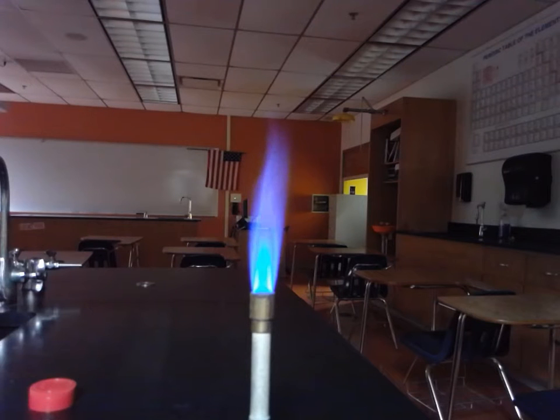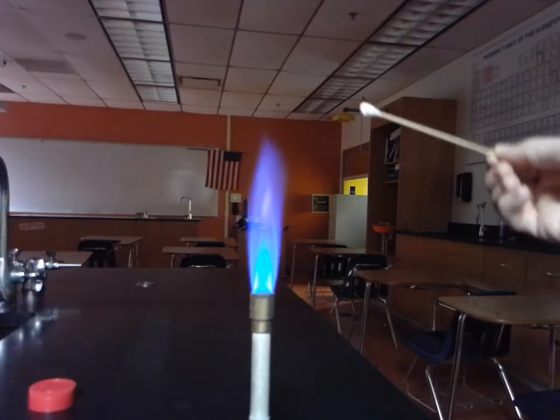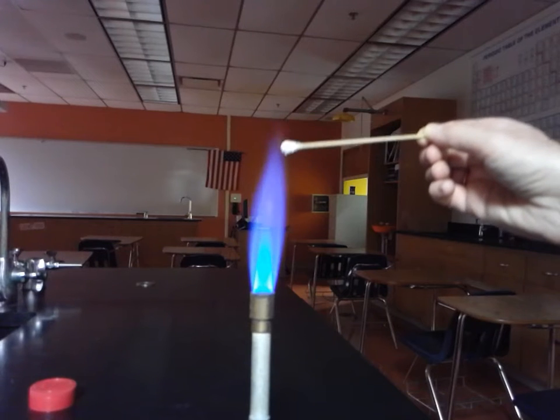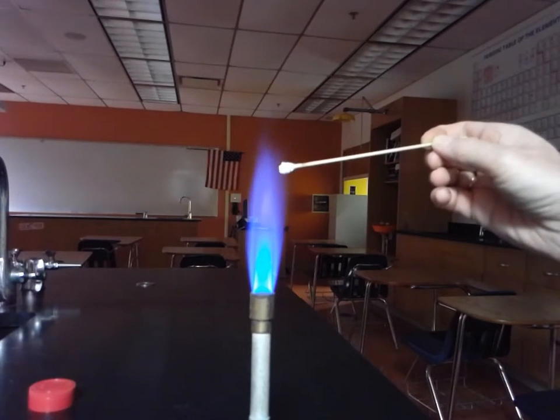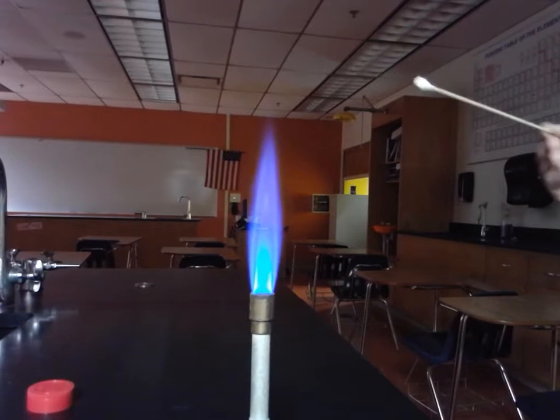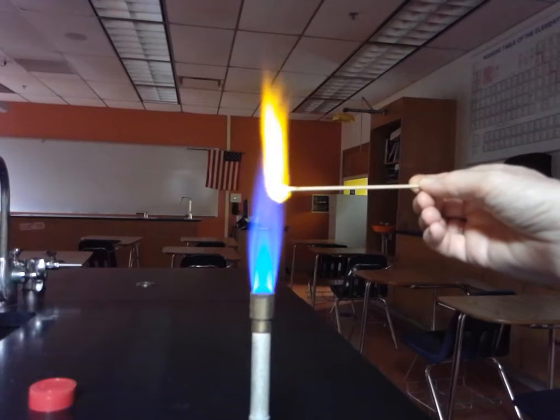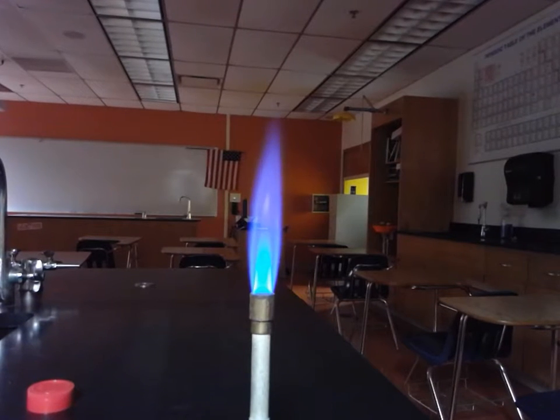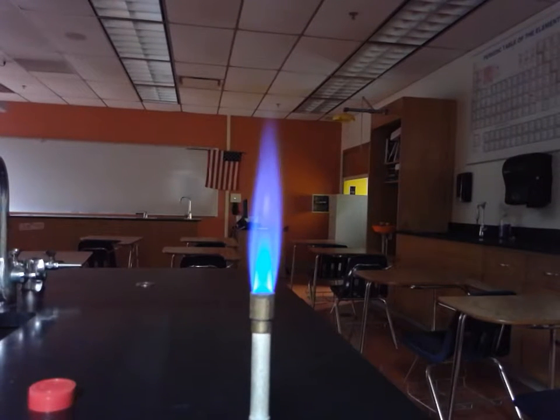Alright, the first one, I believe, is sodium. And you're going to want to watch the flame color. Some of the resolution makes it hard, but right there, see that? That's what you want to write down. I'm also going to snap a picture for you, to collect data that way also, because I'm finding that the resolution is a bit hard with the camera. So that one was sodium, Na.